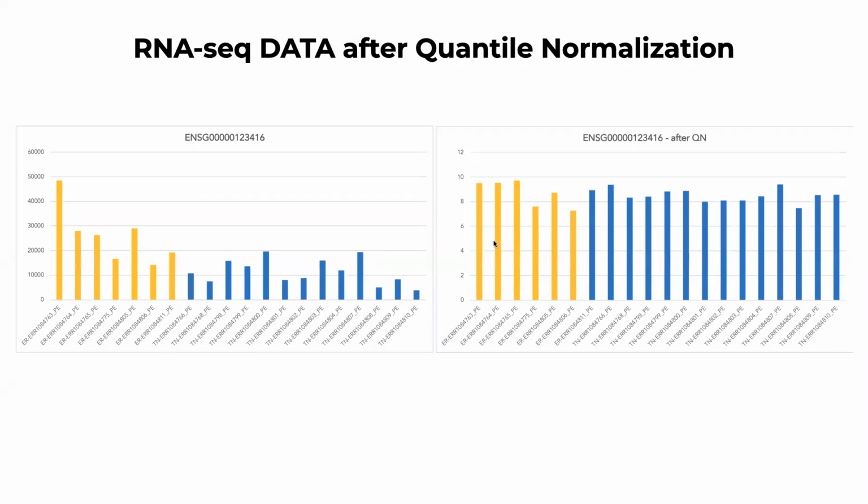If we do quantile normalization and log normal transformation, you can see that that difference is practically zero. So if we find some difference, that is a result of this primarily, right? And this one sample is not representative of this condition. If we look here, that effect is eliminated. And so we are not going to be tempted anymore to consider this a differentially expressed gene.